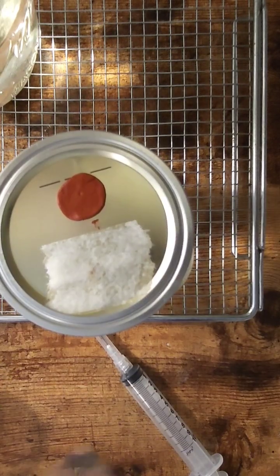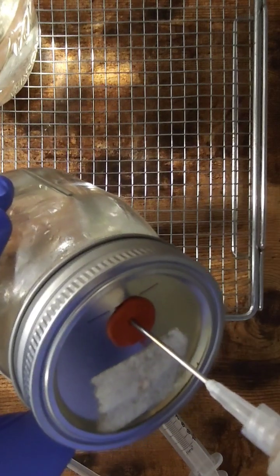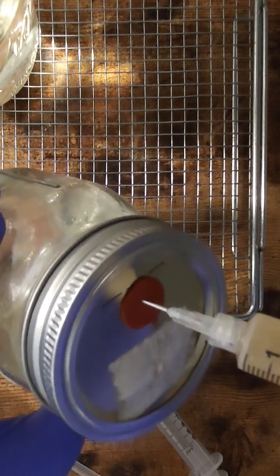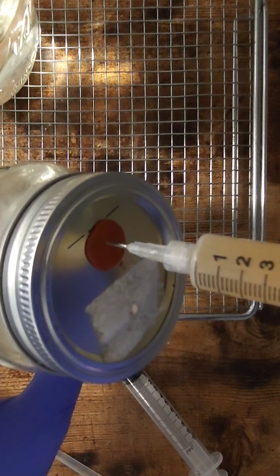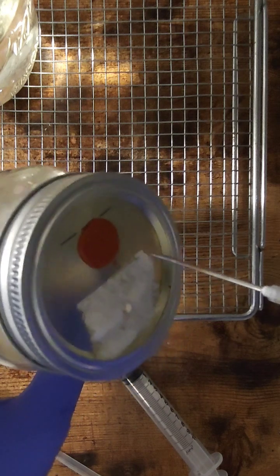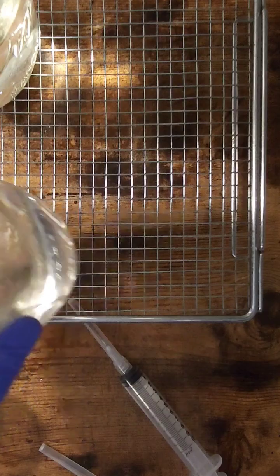Let's shake up this cordyceps. Here we go, and we're going to put in about one CC. Take that out and we can now move this off to incubation.